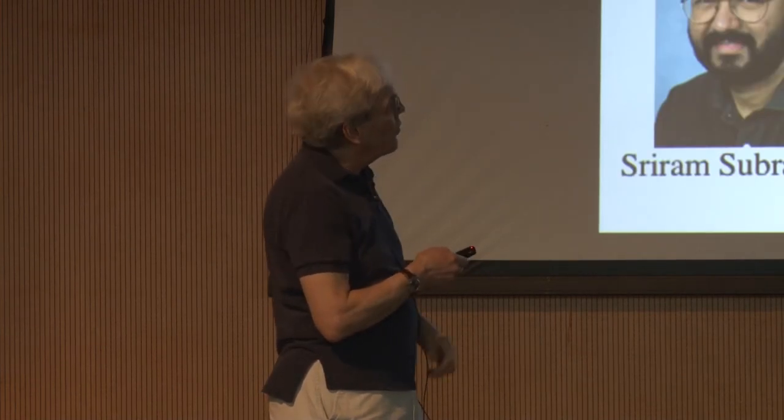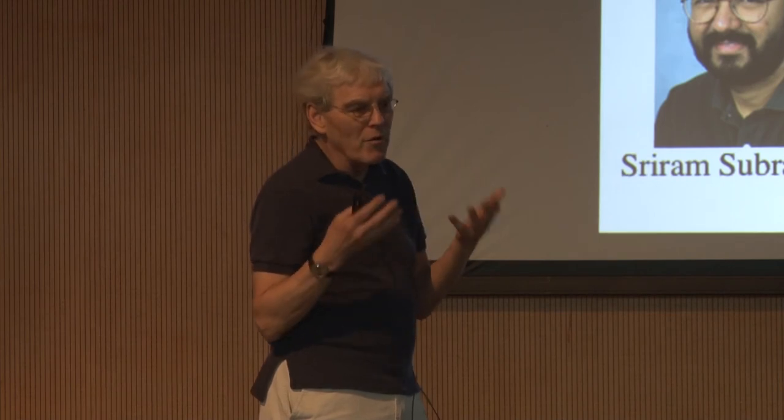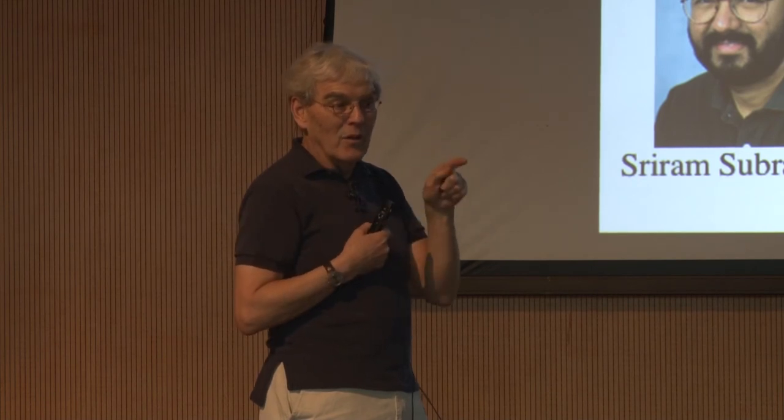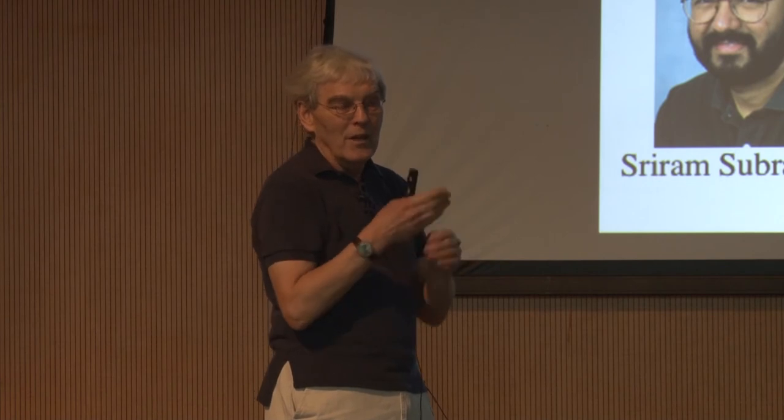the work where we collected some images with Ken Downing and Bob Glaeser around about 1988, the microscope they had was a very old microscope. It was a JEOL 100 kilovolt microscope, but they had a field emission gun on it. It had a very bad vacuum. They couldn't cool it to liquid nitrogen temperature. The vacuum was very bad. They could cool it only to about minus 100.